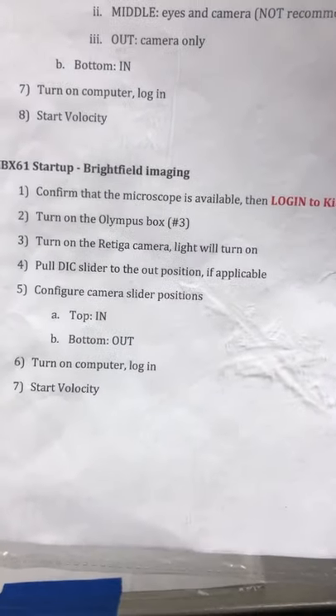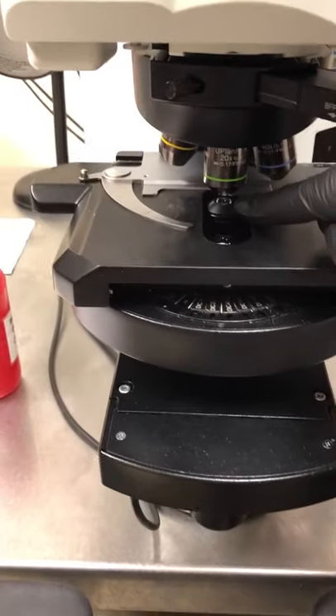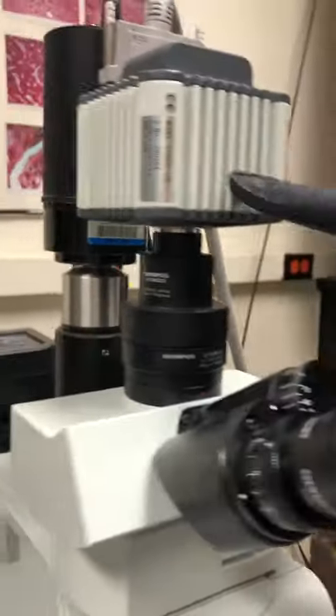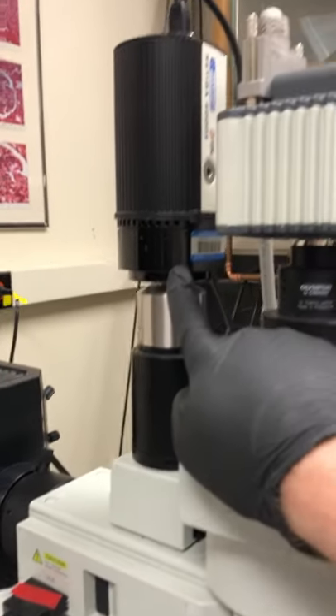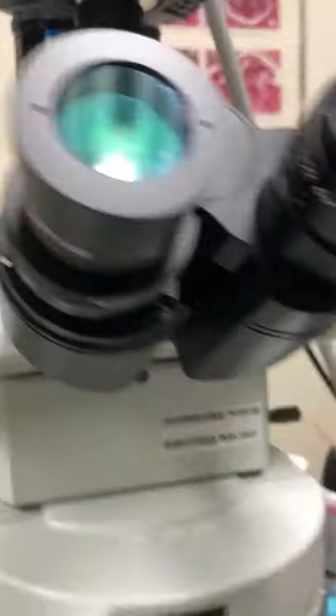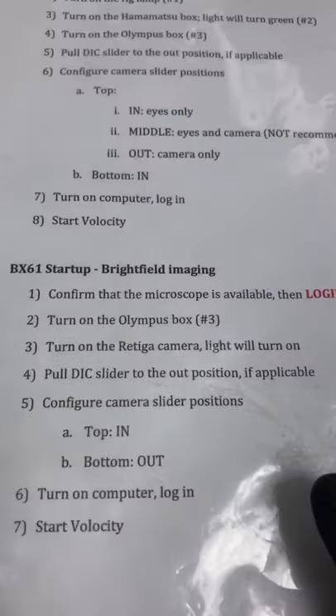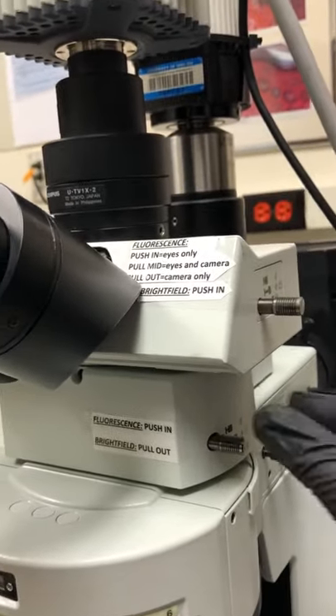Now configure the camera slider positions. The light travels from the lamp at the back of the microscope, through the condenser, up through the sample, then through the objective, and can go to the eyepieces, the fluorescence camera, or the bright field camera. For bright field, we want the top slider pushed in and the bottom slider pulled out. You can see the labels on the sliders confirming this: bright field — pull out; bright field — push in.